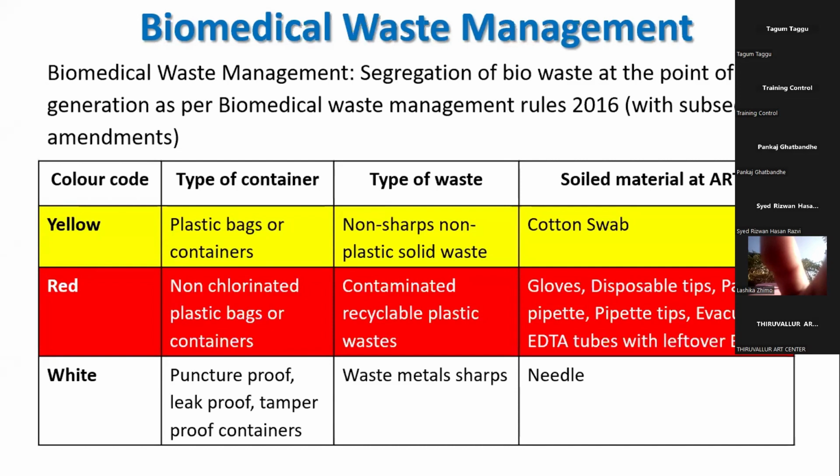Okay, to any of the ART center lab technicians with this question: do not put hypochlorite in your puncture proof containers. The latest biomedical waste guidelines say not to use any hypochlorite solution. Just put your used needles in the puncture proof containers. Once it is 3/4 filled, seal it and give it to the biomedical waste management agency.